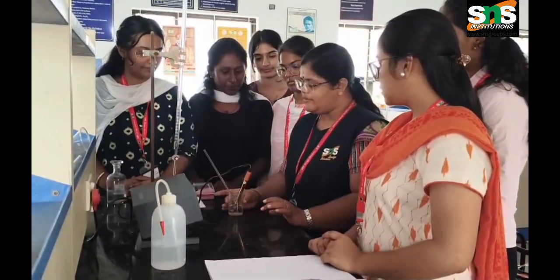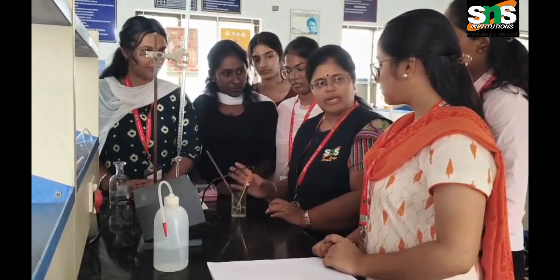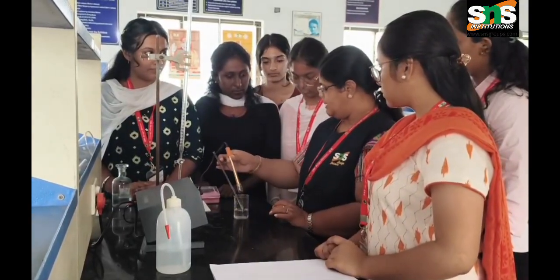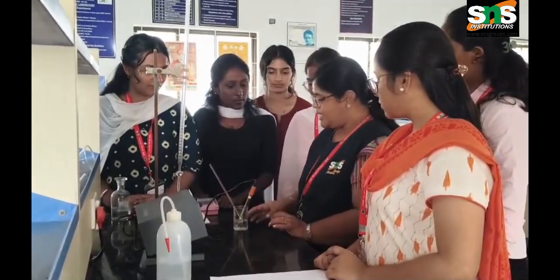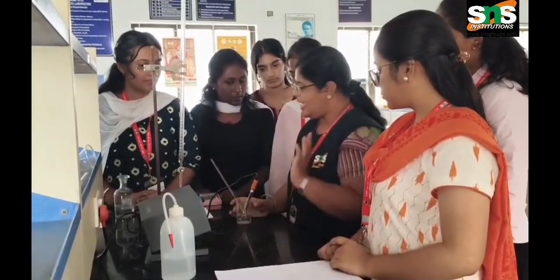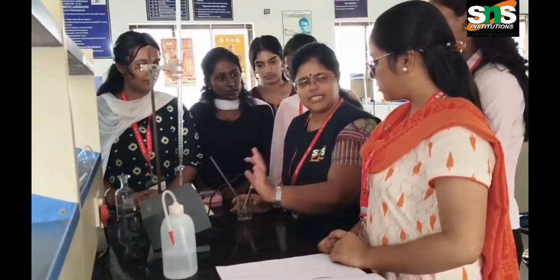I have taken 20 ml of the mixture of acid in this beaker and added 20 ml of distilled water. This electrode is dipped into it. This is the conductivity cell. A potential difference is developed here, and we get a digital value on the conductometer.